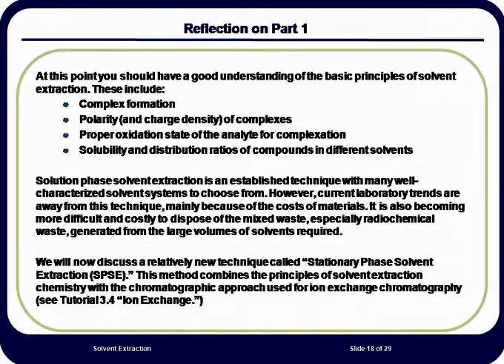The drawbacks to solvent extraction are that it is a labor-intensive process, and it generates organic solvents as wastes that are usually hazardous waste. In the next slides, we will discuss a new technique that avoids the use of organic solvents by coating a neutral resin bead with a thin film of an organic compound that is not hazardous. This technique is known as stationary phase solvent extraction.